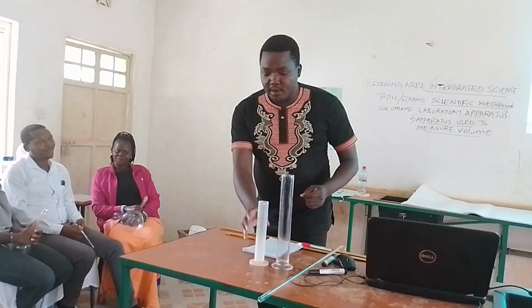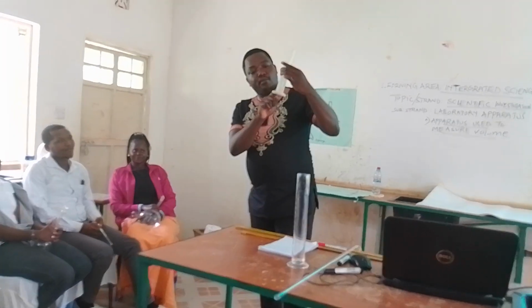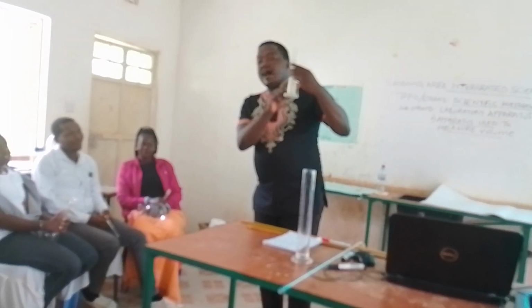Next lesson, we'll look at each apparatus and its function. Yes. The last one. Yes. Did it go to the university? The last one. It graduated. Oh, it graduated. Oh, there's that term graduation. Well, you need to understand, graduation is this scaling from 10, 20, 30.